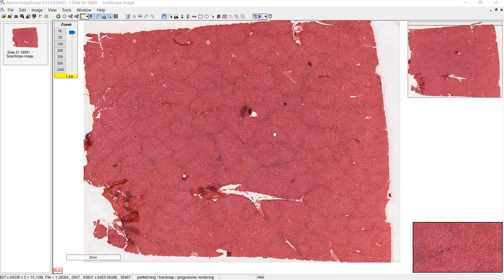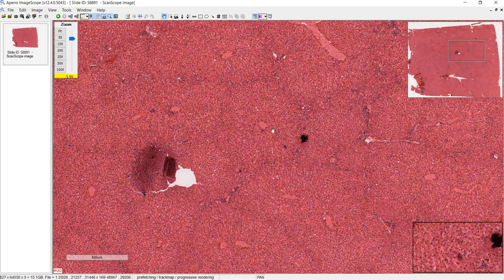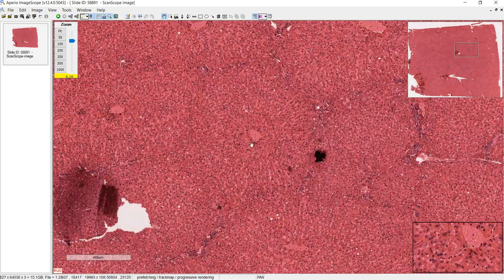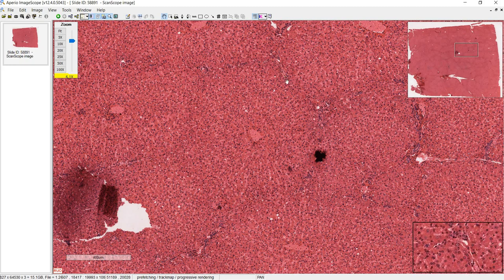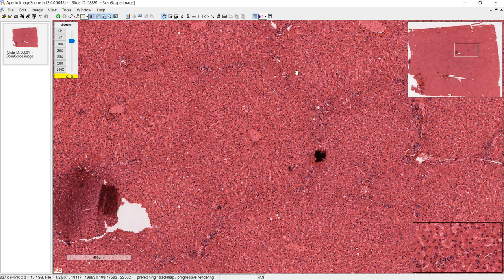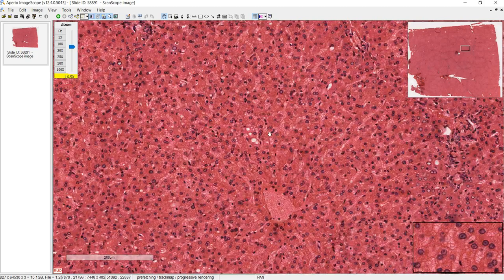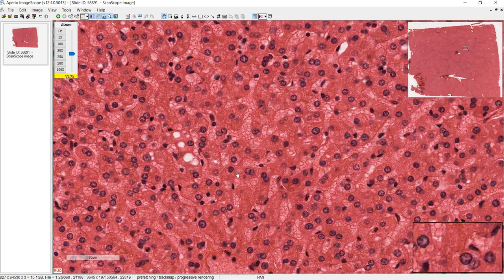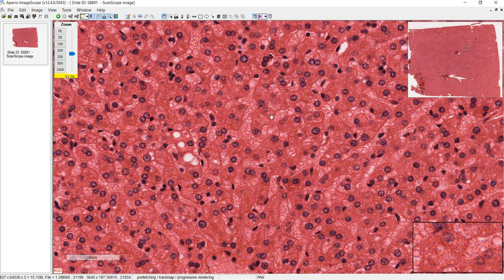Let's talk about the liver. At first glance this just looks like a big giant sheet of cells. In the liver you see hepatic lobules, made of a central vein and the boundaries of the hepatic lobule are going to be where the portal triads are. I usually find them by seeing where the darker areas are with more concentration of blue — that's where you have more nuclei. If we zoom in we can get a better picture of the cell types we expect to see in the liver. The majority of the cells are going to be hepatocytes.